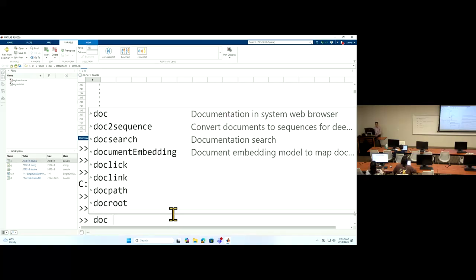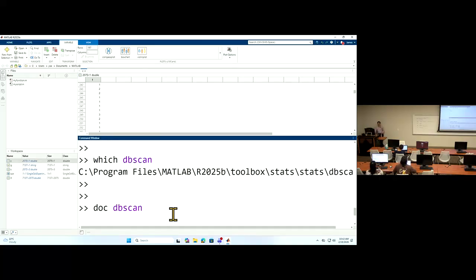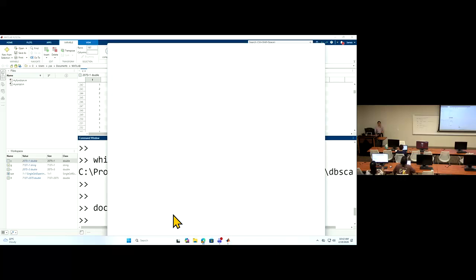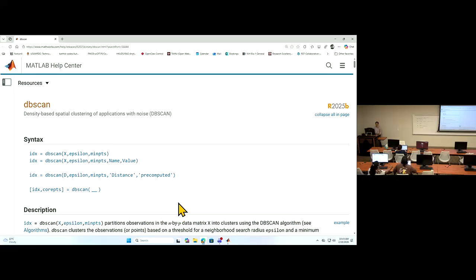So let's try dbScan and read its documentation, because this is slightly more difficult to set up compared to k-means. For k-means you just have an input matrix and a number k. But in this case, we need 2 inputs as hyperparameters.